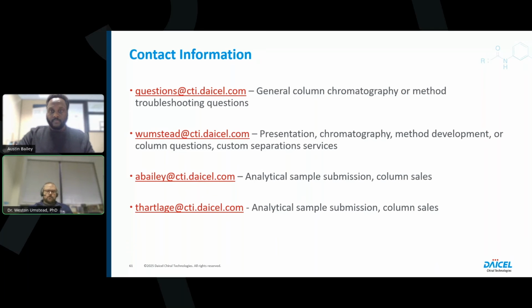So I would encourage you to reference the instruction manuals to get a lot of details around how to adjust flow rate, how to accommodate things like column pressure. The coated 5-micron particles like ADH can go up to 300 bars, so there's usually pretty good flexibility in how you can use them, but you might find that you have to reduce the flow rate on those columns to 0.5 ml a minute. Principally though, which mobile phase you use is going to depend very heavily on all these other 6 parameters that we talked about.